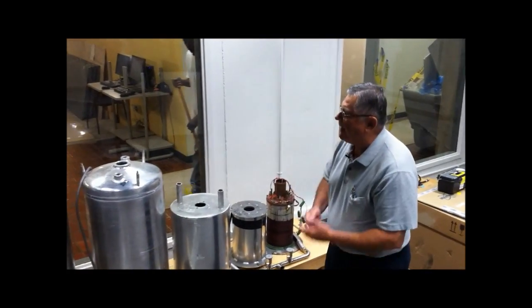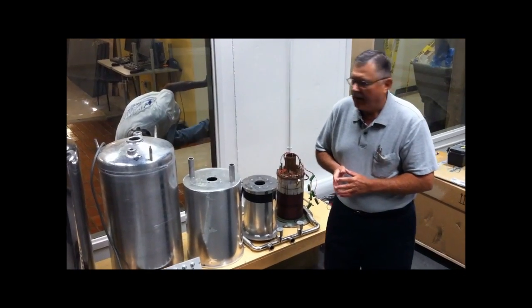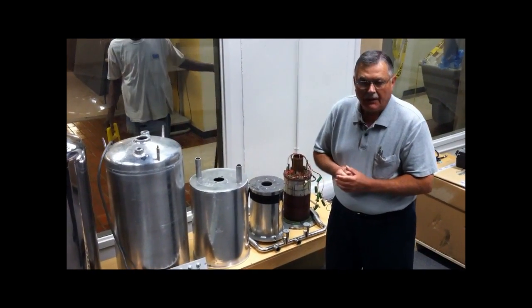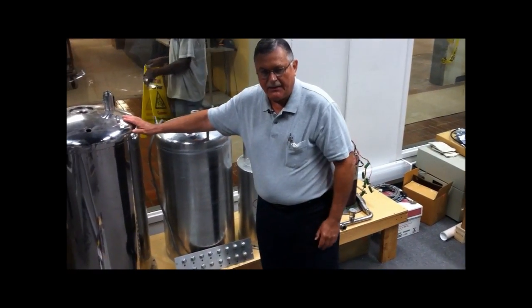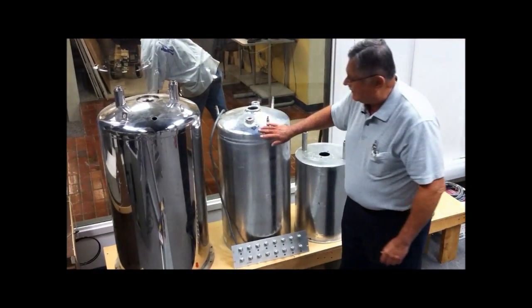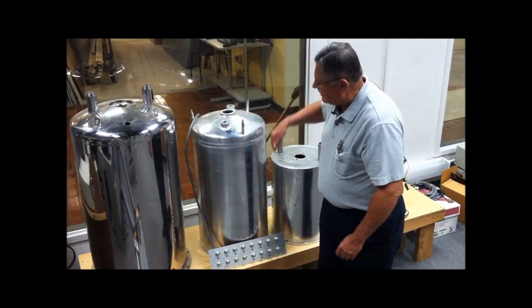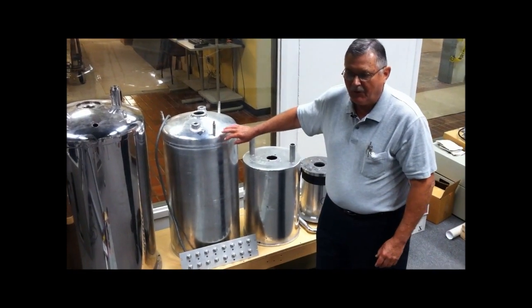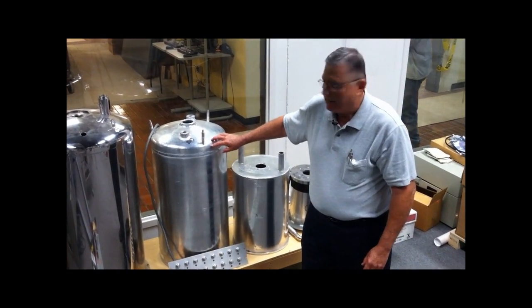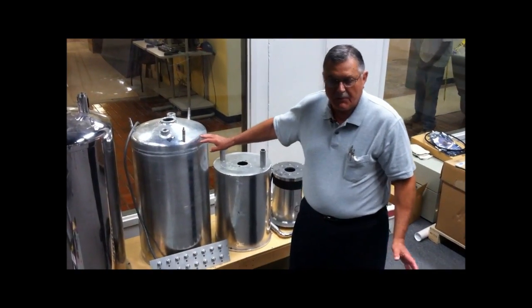What we're looking at here is a deconstructed 200 megahertz Oxford NMR magnet. The outer can, as you can see, is made out of stainless steel. This inner can goes in between, and in normal circumstances there will be layers and layers of metallicized mylar to provide super insulation to keep things cold. Much of that comes from the space industry.